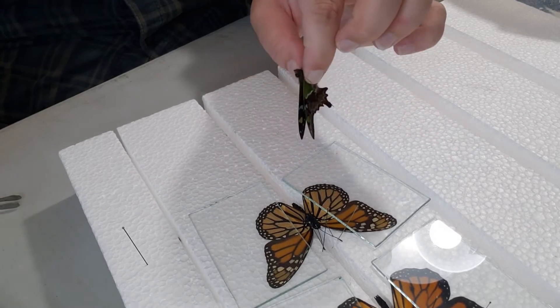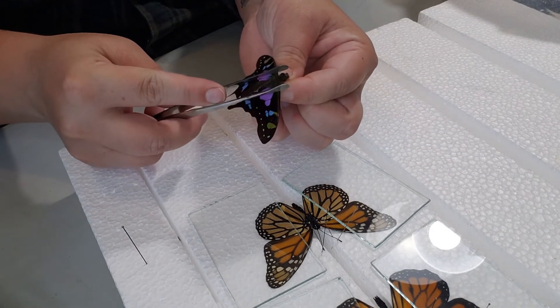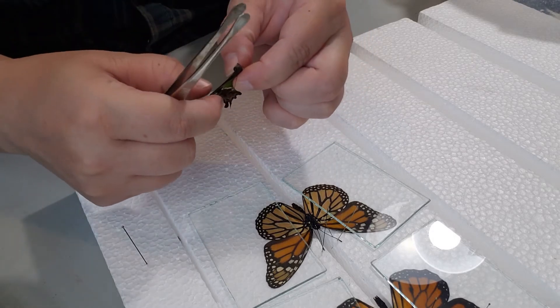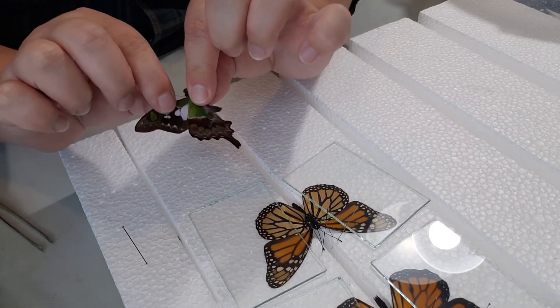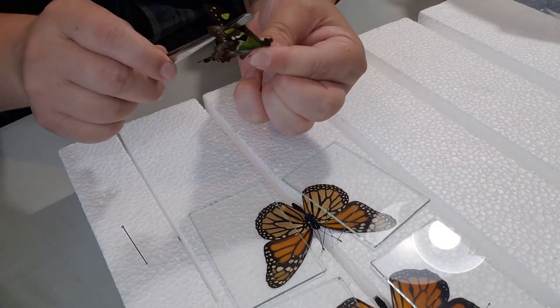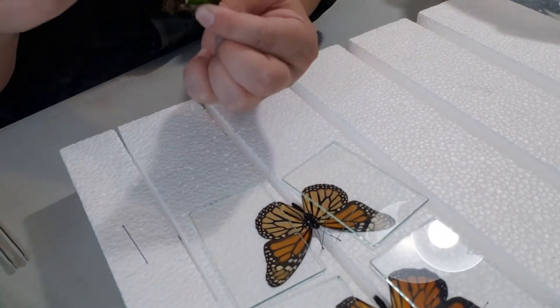The trick with the Graphium weiskei is that because they're smaller, the way their wings are laid out, the wings have a tendency to overlap each other — they'll flip. You may have a problem where the hind wing comes over the forewing, so you need to be cautious of that.